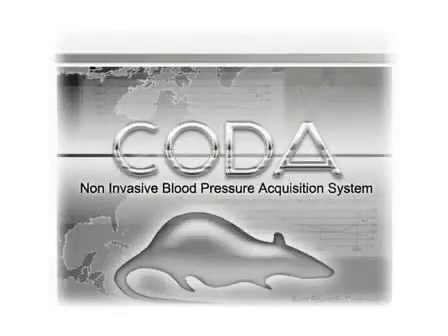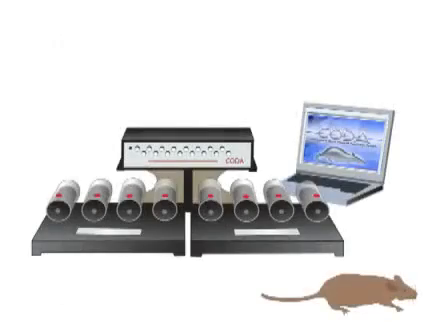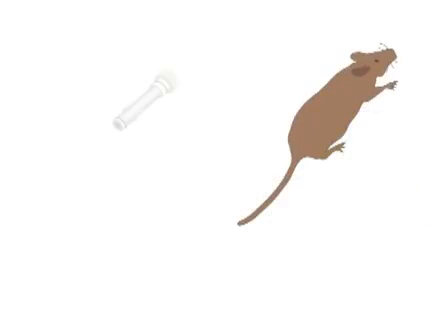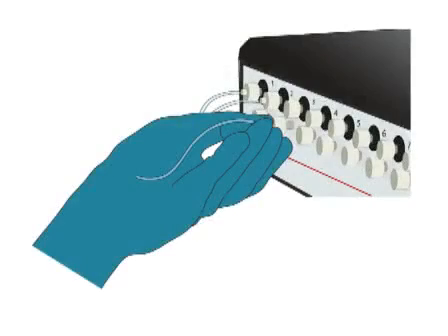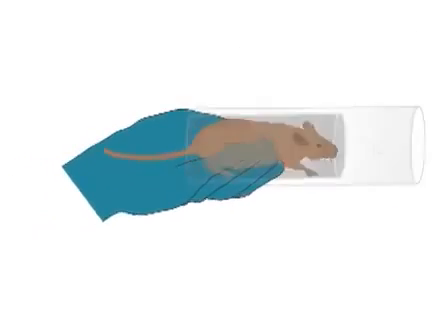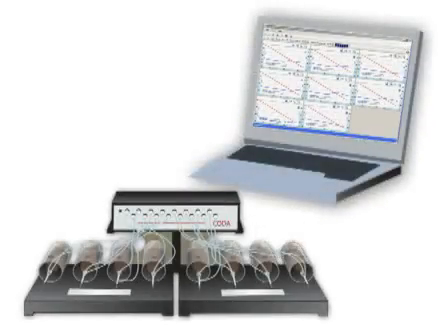The word CODA is Italian for tail. The CODA non-invasive blood pressure system enables blood pressure measurements in rodents thanks to a specialized volume pressure recording sensor that measures tail blood volume changes when placed over an animal's tail. This video demonstrates how to set up the system, prepare the animals, and acquire blood pressure measurements for eight animals simultaneously.